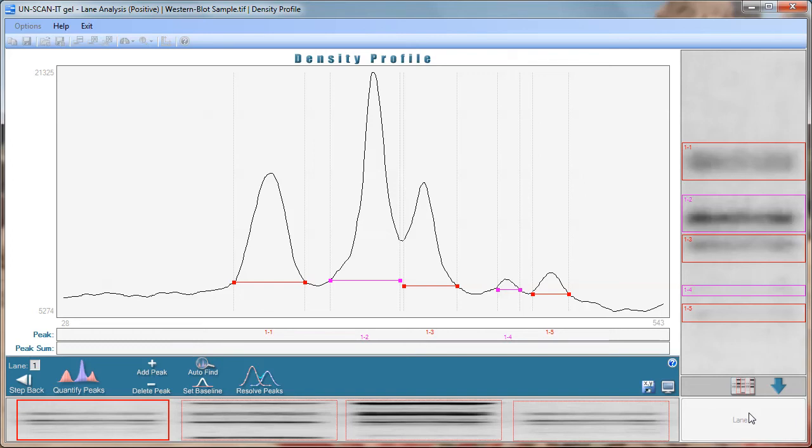Since we are using lane analysis mode a density profile screen will be displayed for each lane. General information regarding the density profile can be displayed by clicking the question mark button at the bottom of the density profile.